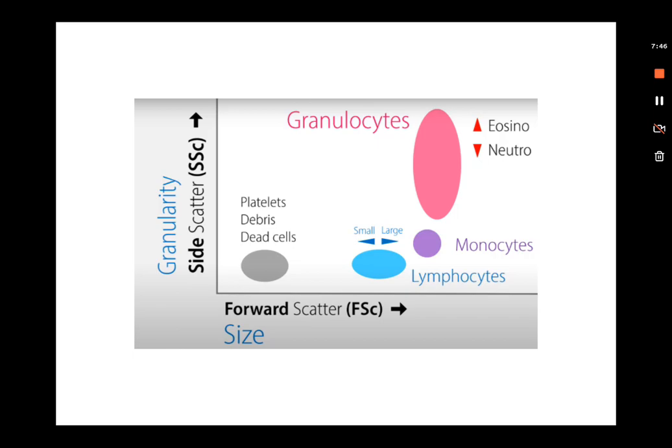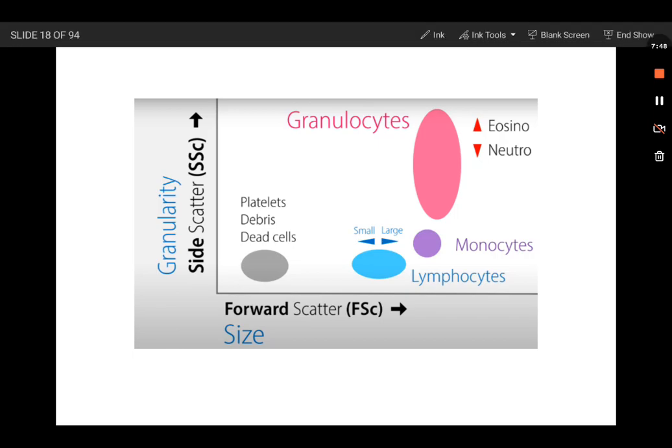An imaginary line is drawn from the x-axis, and there is a common point of origin. So an imaginary line is drawn joining it on the x-axis, and it is extrapolated. Similarly for the y-axis, and extrapolated. How do you decide this common point of origin? It varies from machine to machine, and it's a very technical aspect which is beyond the scope of basic pathology.